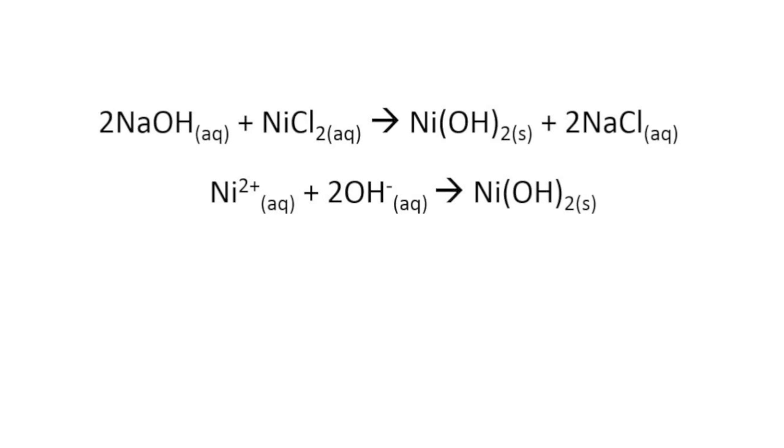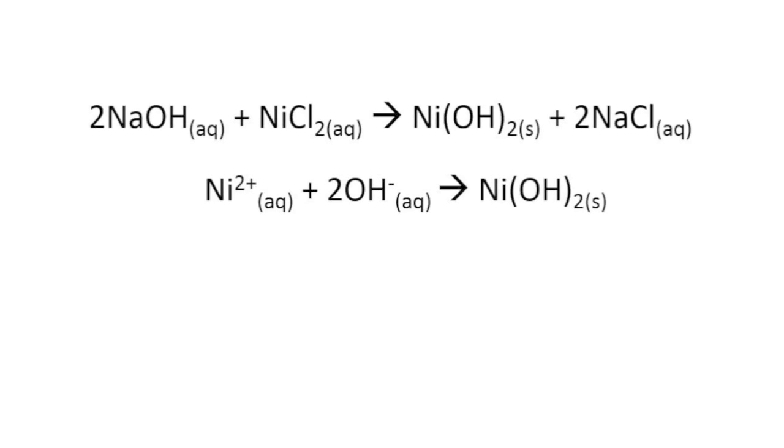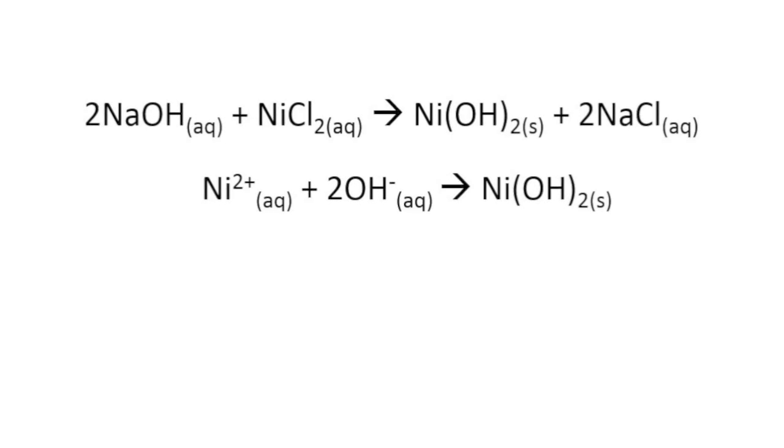If we look back at our balanced chemical equations, the reactions we observed seem to match the reactions we theorized to occur. Yay!